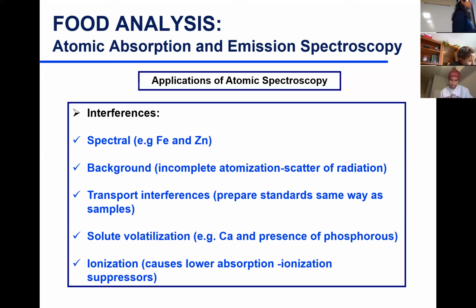Transport interferences. So what do you have in your samples? What reagents have you used, and how did you prepare your standards? You want to make sure that your standards are prepared in the most similar way to how your samples are prepared.